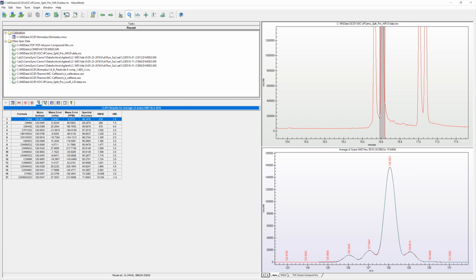If they are chromatographically separated, it's no longer a problem because you can identify each and every one of them individually by limiting yourself to a specific retention window. So whether you have an absolutely pure standard or not, it's of little or no concern in that case, because even though you have isomer impurity, they are chromatographically separated.